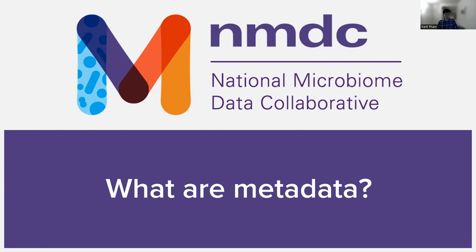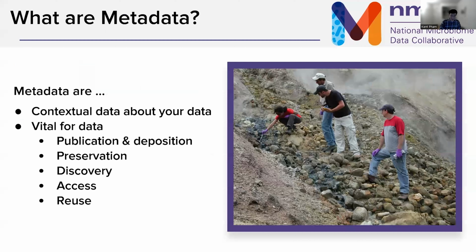This brings us to the main question that I hope we'll have answered by the end of this video: what are metadata? That always trips me up. It's a plural thing. At its core, metadata are the contextual data that go along with the primary data that you are capturing out in the field.